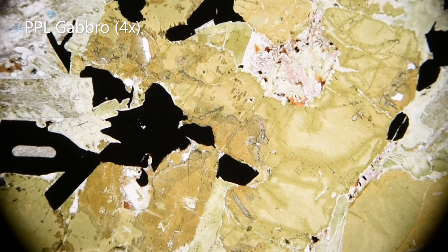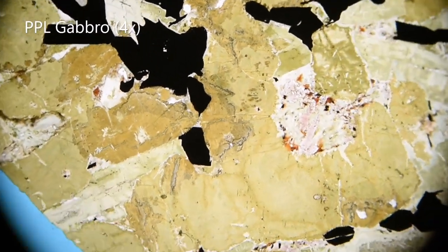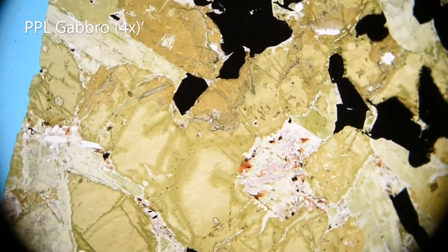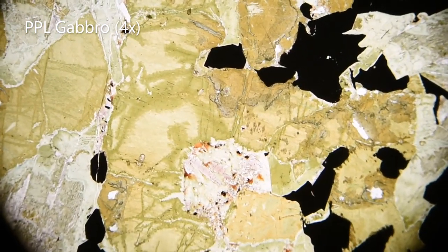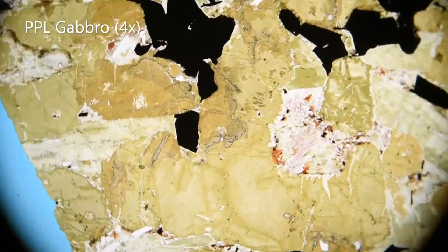Pleochroism refers to a shift in color as you rotate a sample. This sample is a gabbro like the last, but has been altered with biotite and serpentine. Biotite is the mineral that changes from brown to green as the sample rotates.